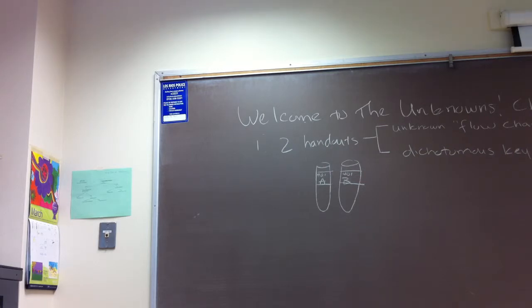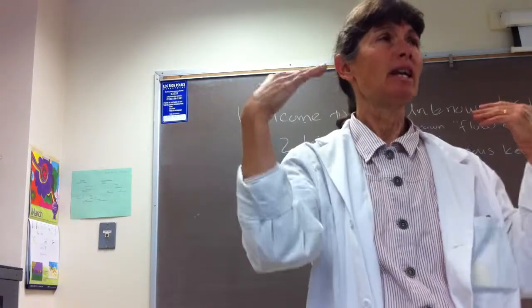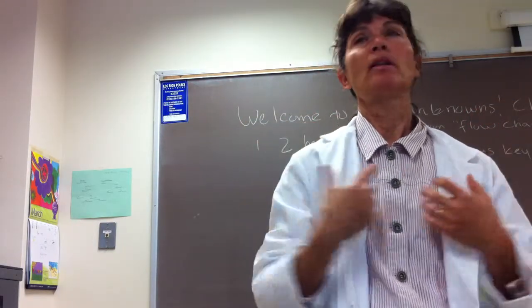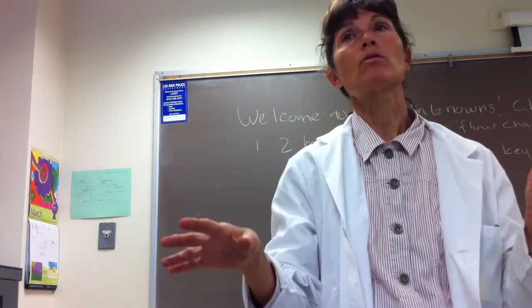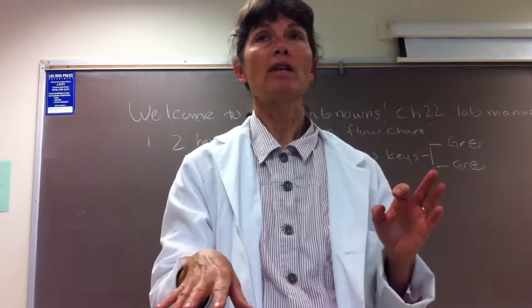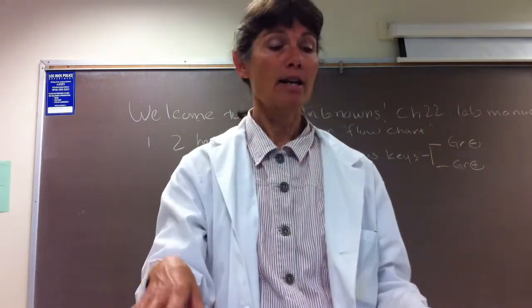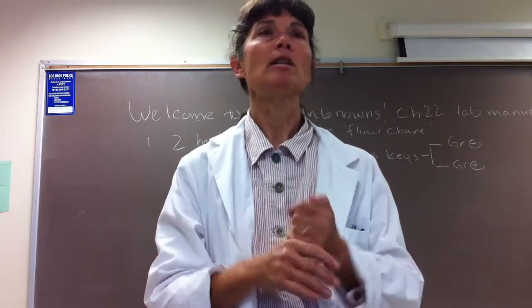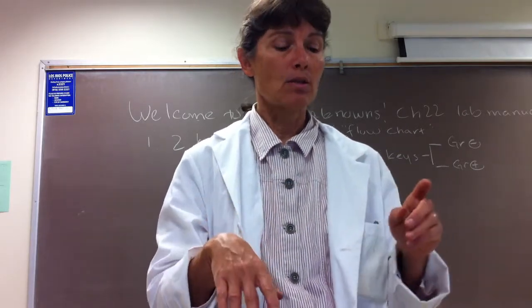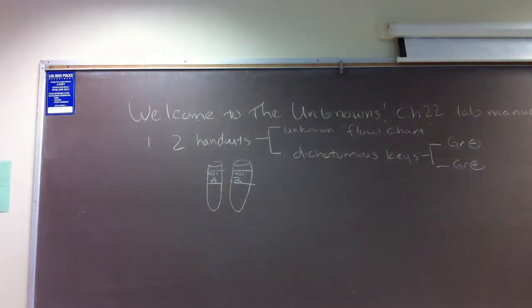The reason is there have been studies that have shown that you save time and money in microbiology. If you have any doubt at all, if something has been contaminated, don't use it. Many of you are so considerate, you don't want to waste things, right? But you will save us money and save yourselves time. If there's the slightest chance something's contaminated, don't use it. Just bring it over here and put an X on it.